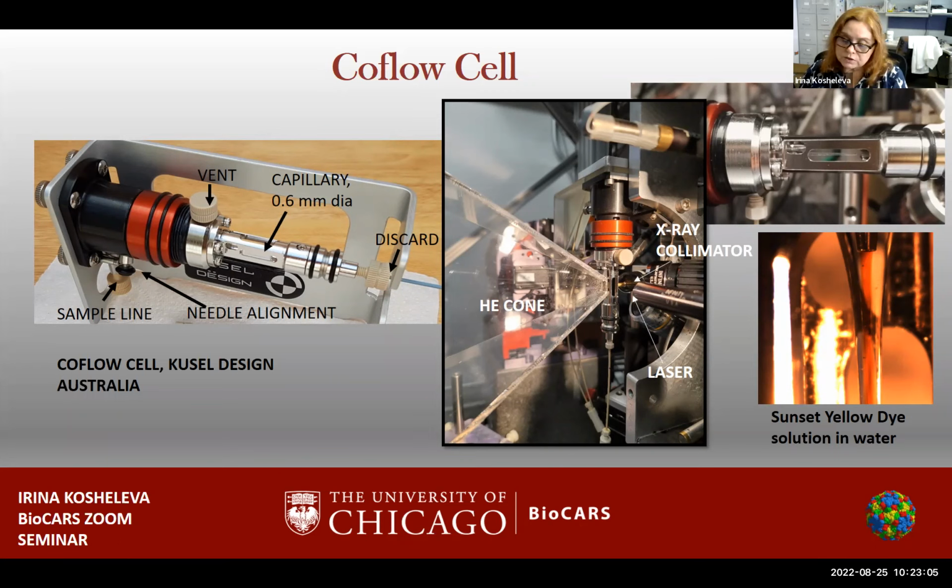In X-ray solution scattering, a co-flow device used for static SAXS was used by scientists from the Australian Synchrotron, Nigel Kirby and Tim Ryan.